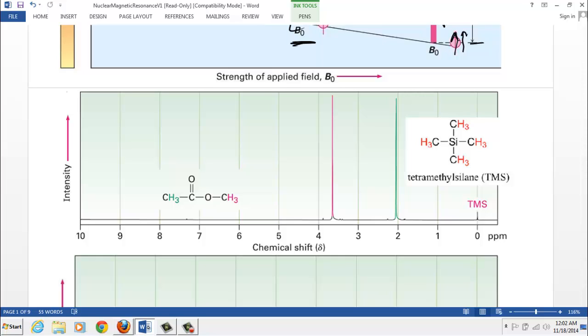Then the second thing can happen here that makes it useful. Here the magnet's been tuned to hydrogen nuclei, and we have a mixture of two compounds in this spectrum. We got this molecule called TMS. It's a reference compound. Typically you put that in every NMR spectrum we take, and the idea is it's got a nice symmetrical molecule, lots of hydrogens, 12 total, and they all contribute to a single peak, this little bump down here.